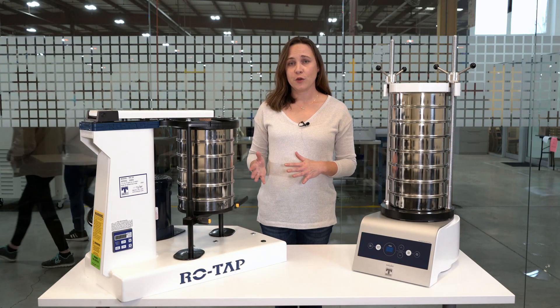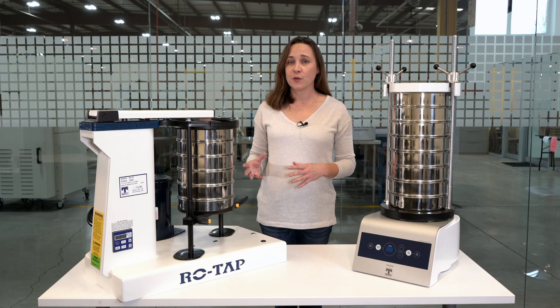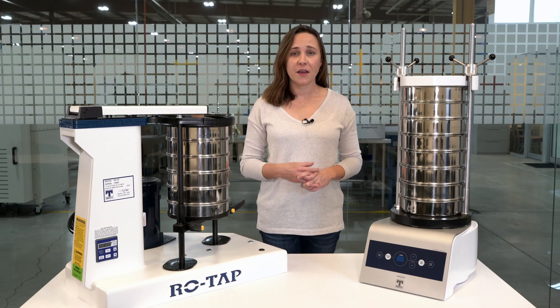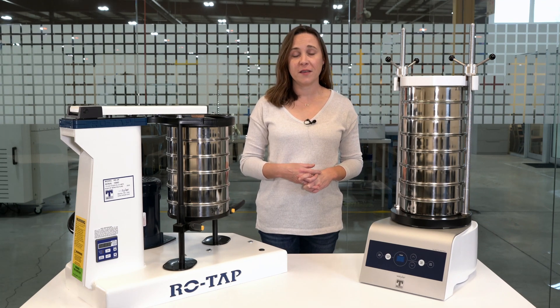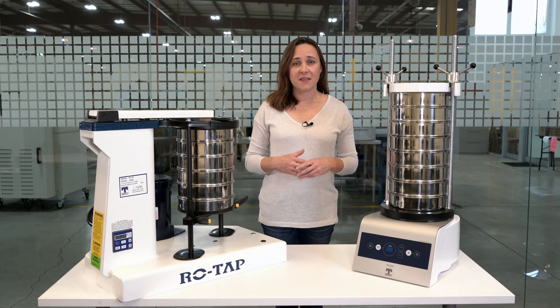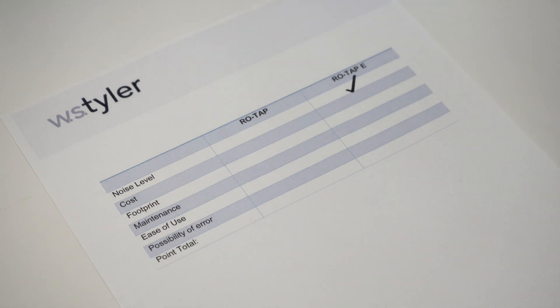By its nature, the original mechanical ROTAP is a much louder machine. The hammer tapping on top of the sieves and the method of oscillation causes that high noise level. On the other hand, because of the ROTAP-E's electromagnetic motion, you'll hear just a buzzing noise. Because of these differences, we'll give the noise level advantage to the ROTAP-E.